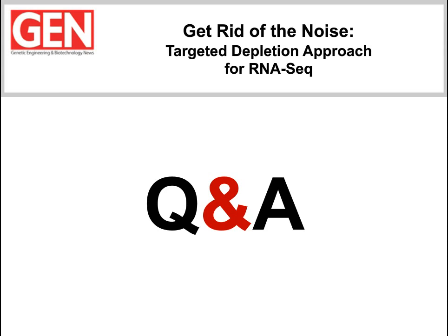Yes, so we have successfully sequenced Solo libraries on both the MiSeq and the NextSeq instruments from Illumina. They sequence well.